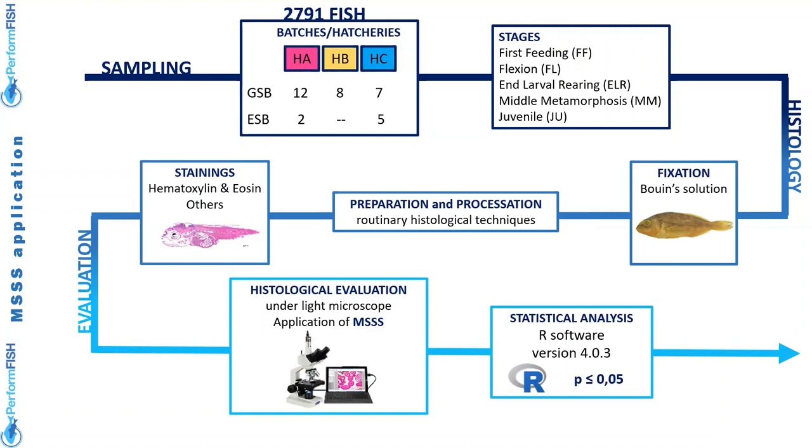The samples were observed under optical microscope, of course, and our scoring system was applied for all the descriptors, and OCV between hatcheries was assessed.